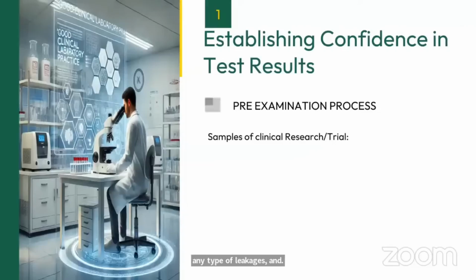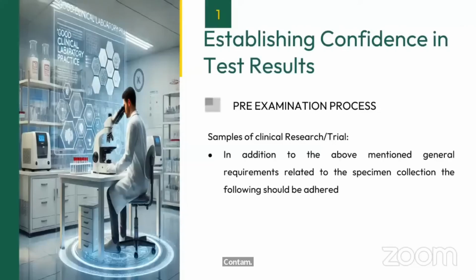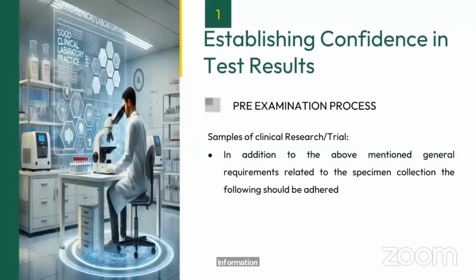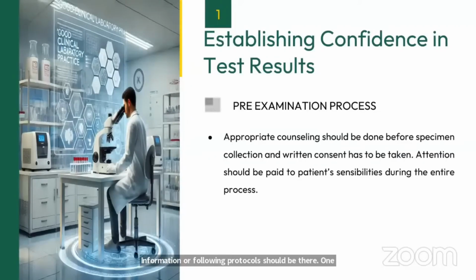Now, samples for clinical research and trials, in addition to the above mentioned general requirements related to specimen collection, the following protocols should be adhered to. What are these protocols which you should adhere to? Appropriate counseling should be done before specimen collection, and written consent has to be taken.